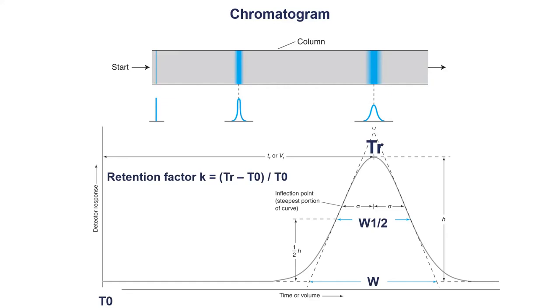I don't want to go into too many details. Maybe most of you know it already, or you can also read it later, but the important part is that you have the highest point from your chromatogram for your ion. And then you always need to know the time that the injection was happening, and everything that was not retained is eluting out of your system. This is what you use with T0 as well. And then you know everything that is not retained has a time of 1 minute, maybe a bit longer, and then everything else should stay longer, or you could check different retention factors.